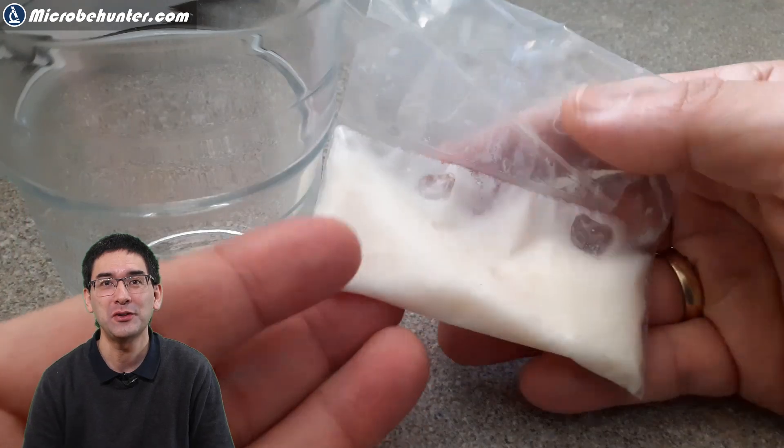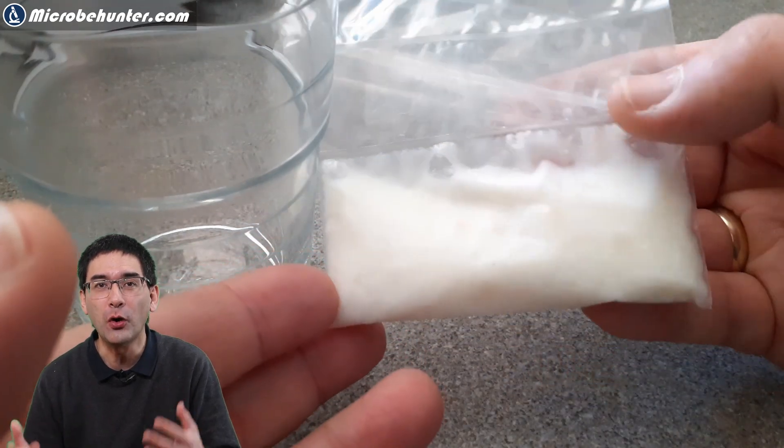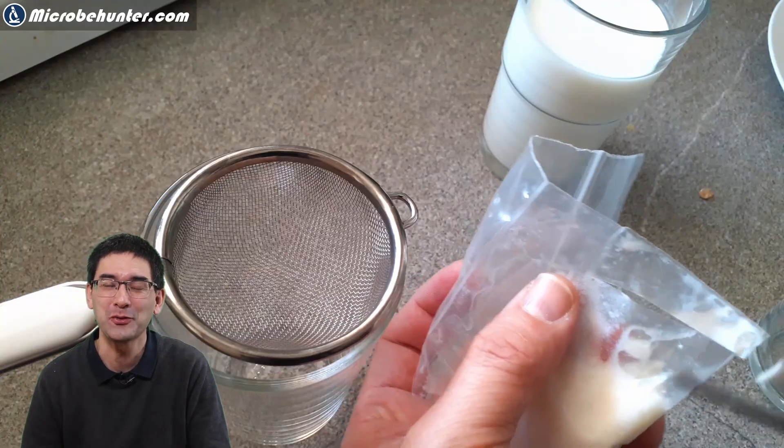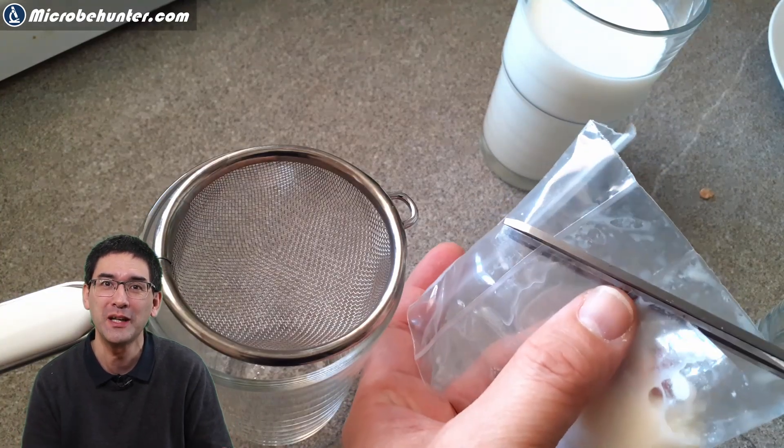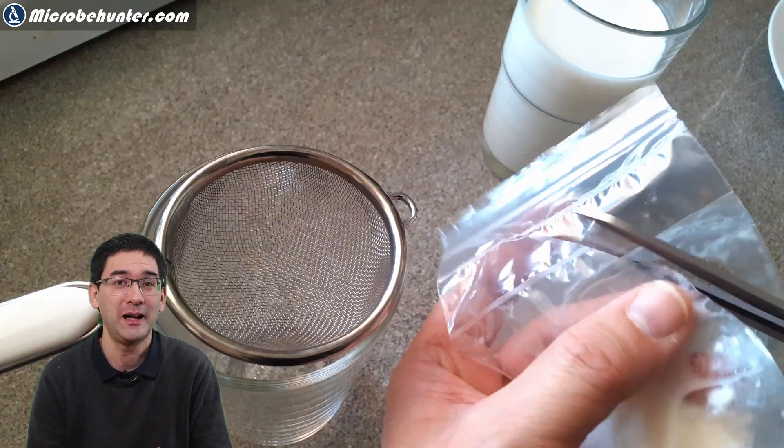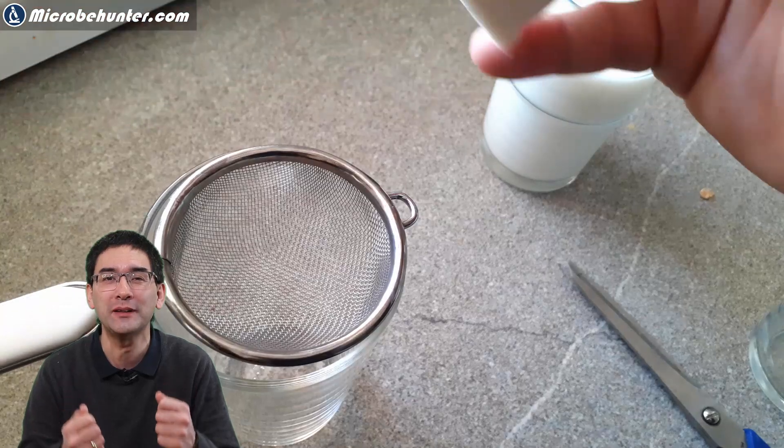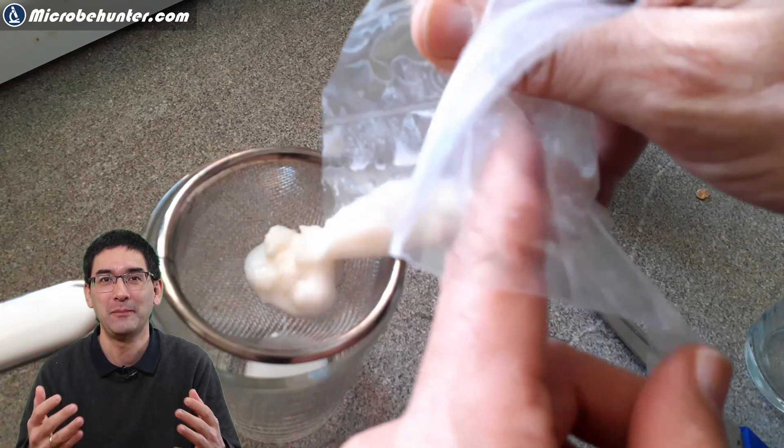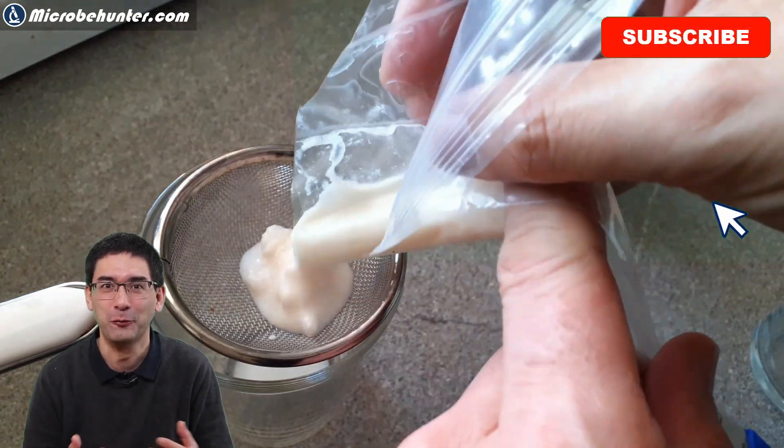The first thing that I wanted to do is to remove all of the milk that came with the kefir grains because I wanted to put it under the microscope and see the kefir grains alone. Those of you who have already made kefir before are probably going to scream right now and say, don't do that. Don't put the kefir grains into a metal sieve. I didn't have a plastic one, unfortunately.